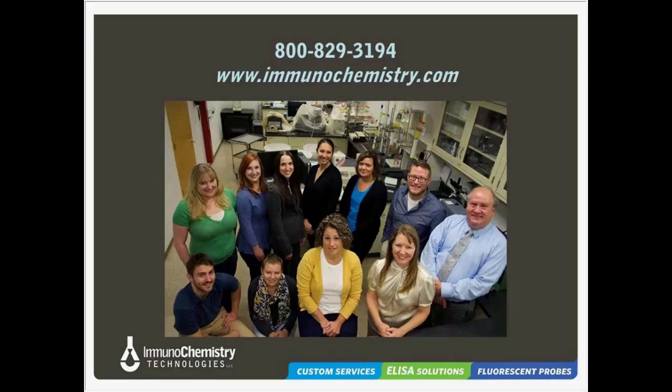You can make it go faster at 37, and people have incubators for that. But if you're just putting it on your lab bench or sticking it in the drawer, you're looking at least an hour and a half, maybe 2 hours for the antigen capture to the capture antibody on the plate step. So that's usually your longest step.